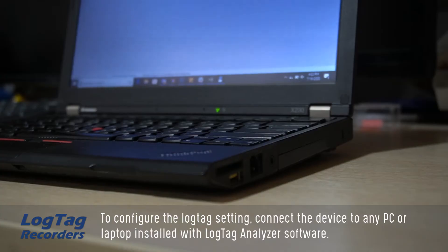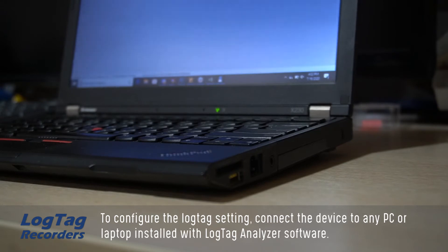To configure the LogTag setting, connect the device to any PC or laptop installed with LogTag analyzer software.